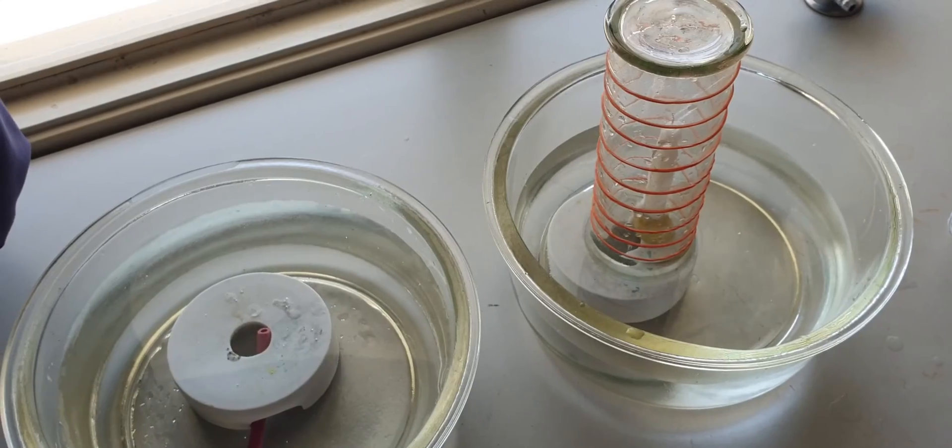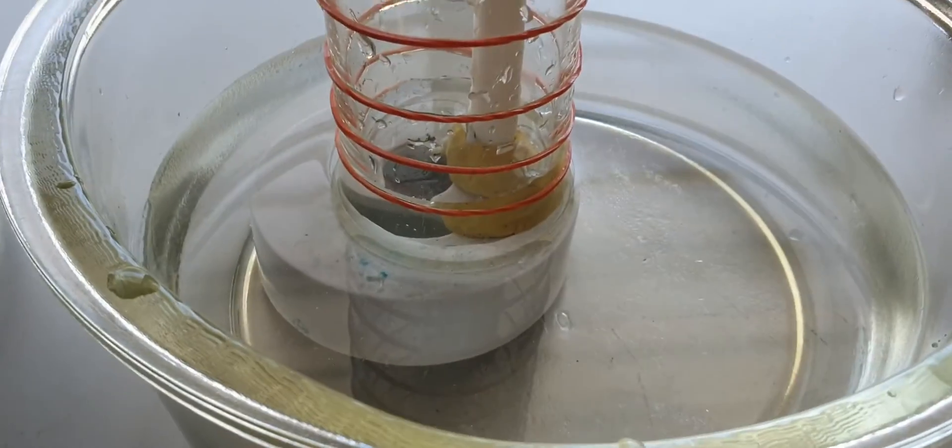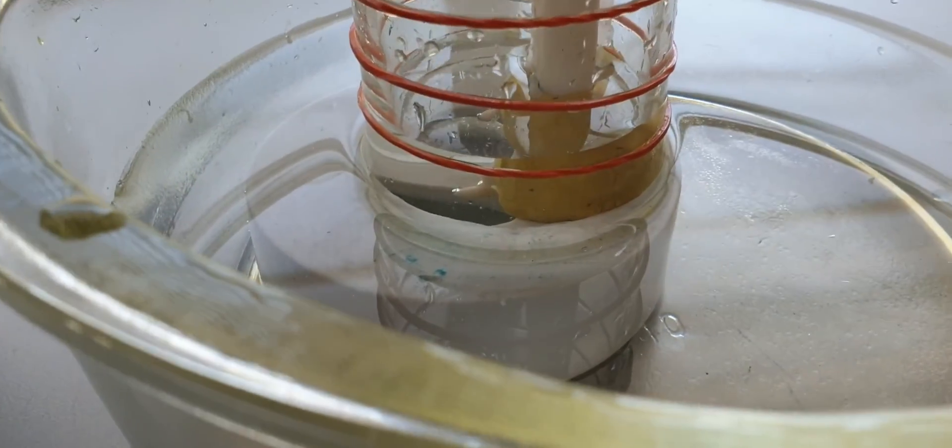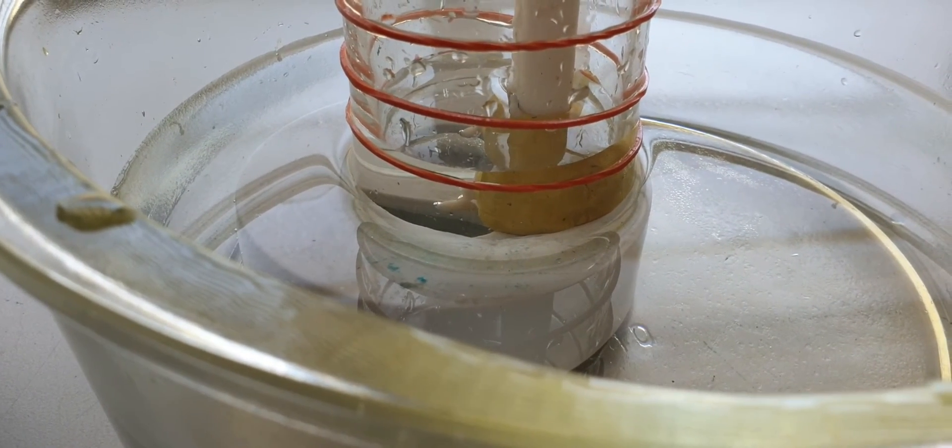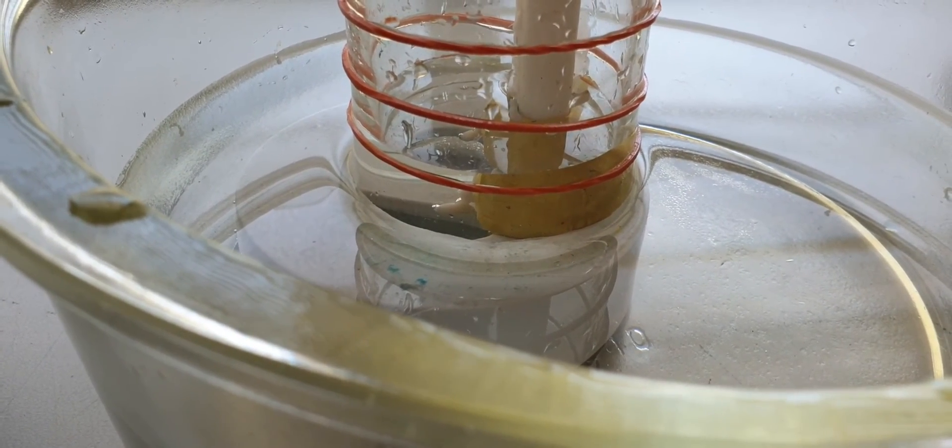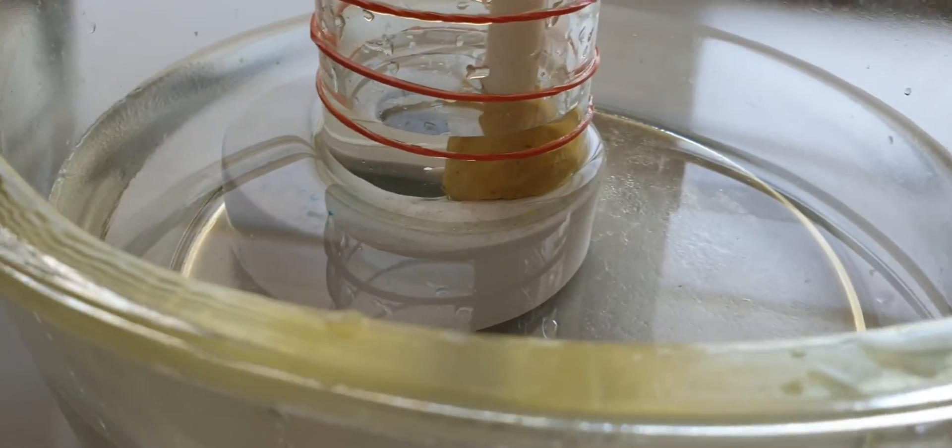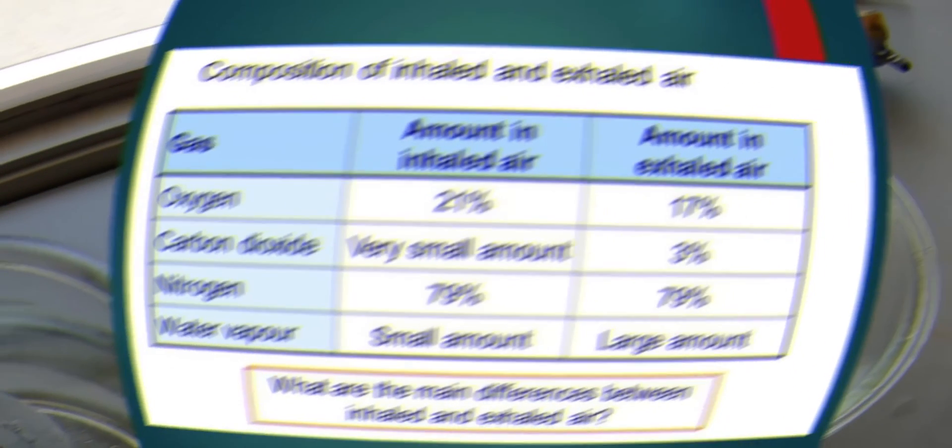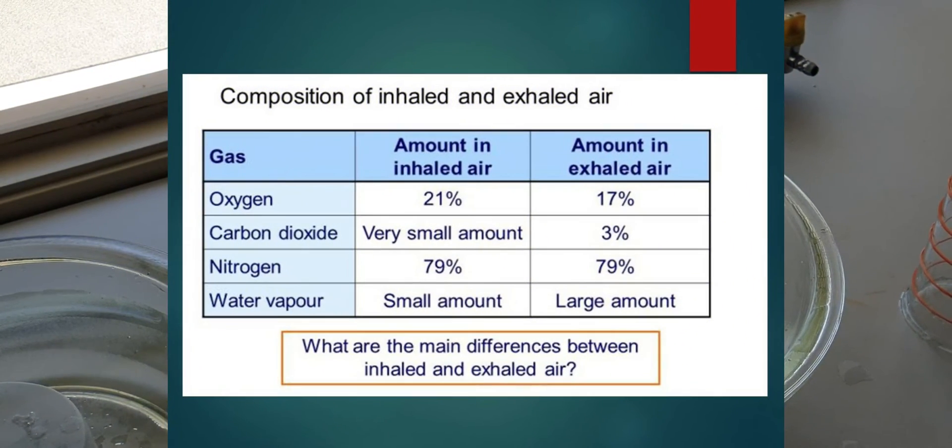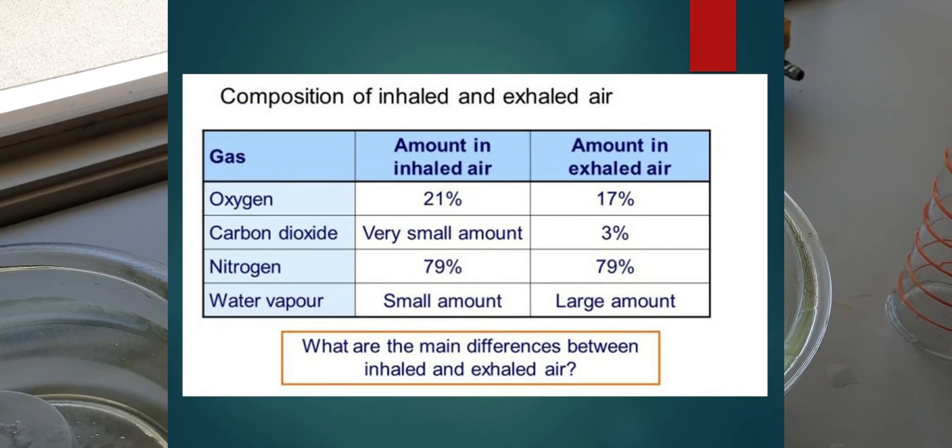You can see the water is rising up. The water rises about just a little bit higher than the first level, about one and a half, something like that. So the exhaled air contains about 15 percent of oxygen.